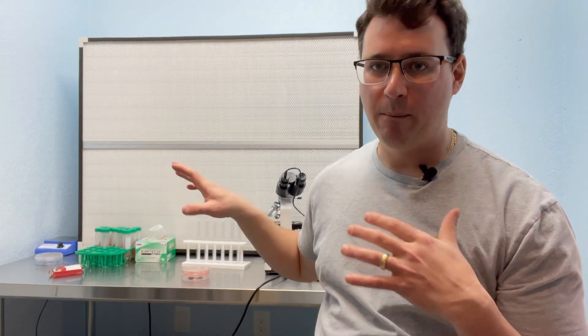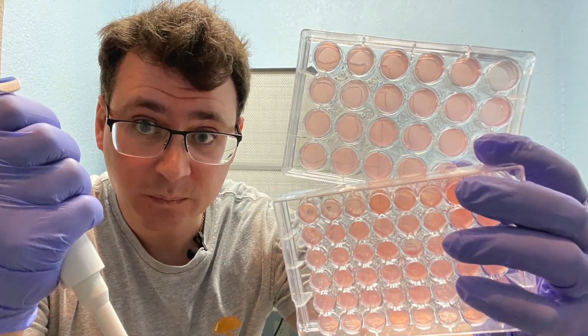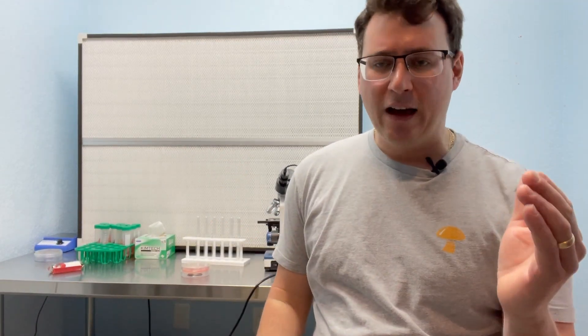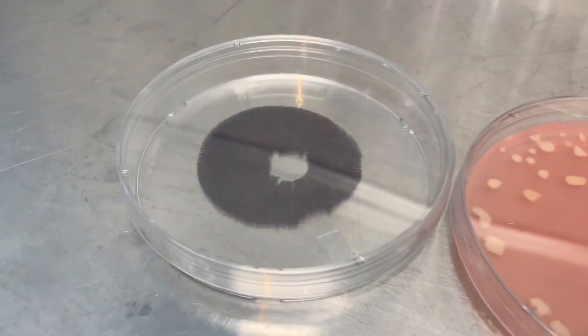I finally have the time to dive deep into microwell breeding, so this breeding series is going to be available soon on YouTube once I'm done. One of the important factors of using this technique is understanding the difference between a single spore and a colony forming unit.